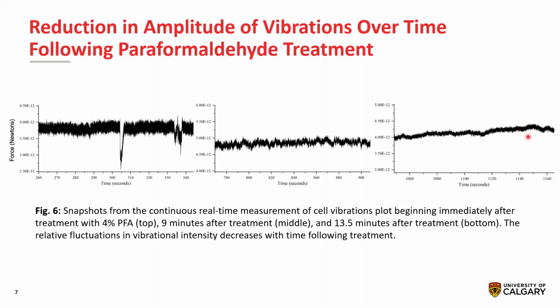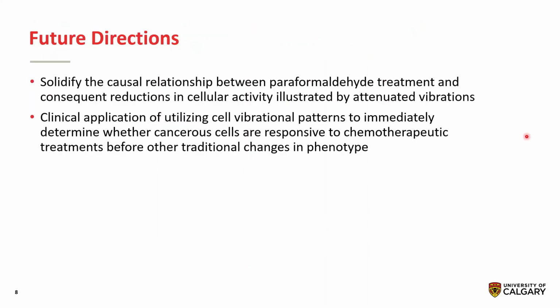Now, so far, we've only demonstrated a correlational relationship between paraformaldehyde and reduction in vibration. So in future experiments, we'd like to causally solidify that relationship to prove that cellular activity itself is being reduced and attenuated by paraformaldehyde. Ultimately, this novel method, showing how cells are immediately impacted by treatments, has the possibility to significantly improve upon current chemotherapeutic treatments, which sometimes take weeks to months to show traditional changes in phenotype.